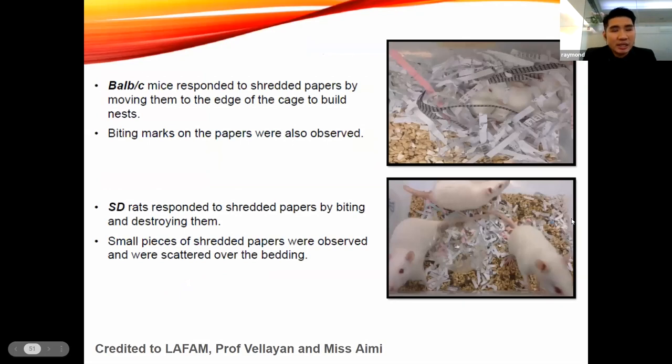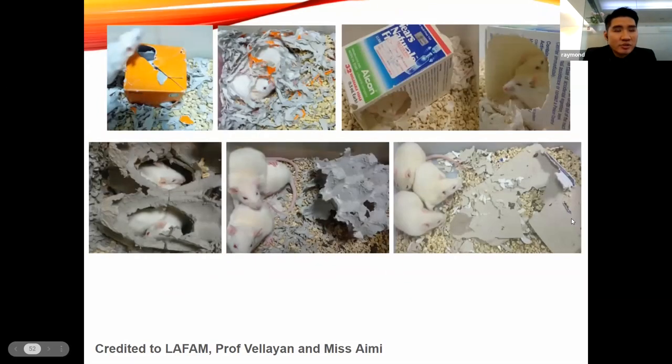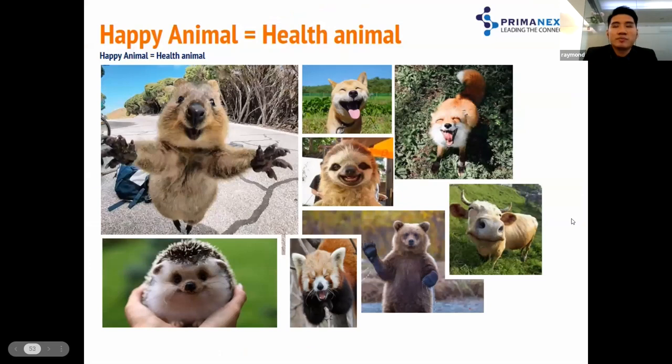And they start to put it in, and we can start to see that the animals are interacting with it. You can see that the animals are playing, hiding, as well as interacting or using it to create their own nest. So all this can be done with a little bit of gifts of creativity. To end my talk today, I would like to also reiterate and express: happy animals are healthy animals.